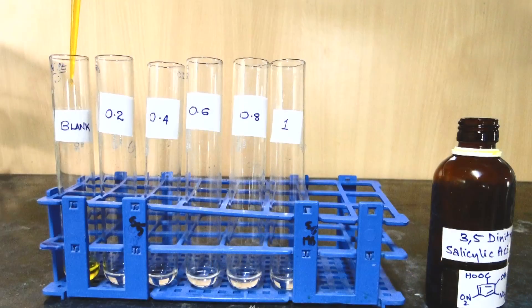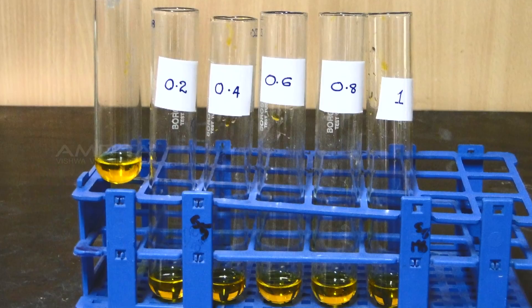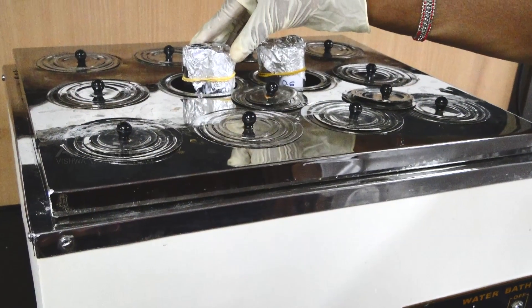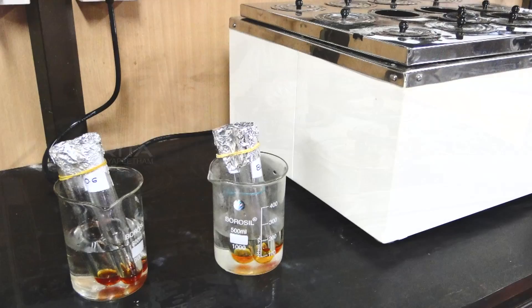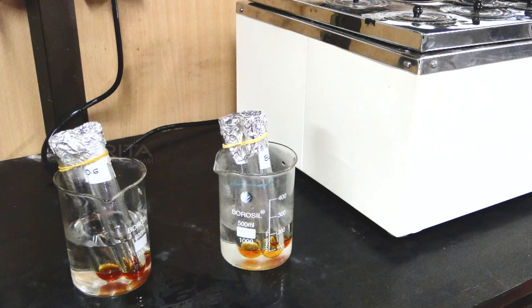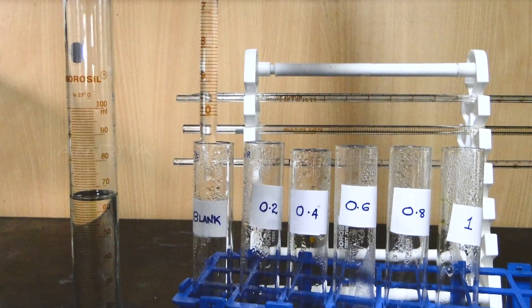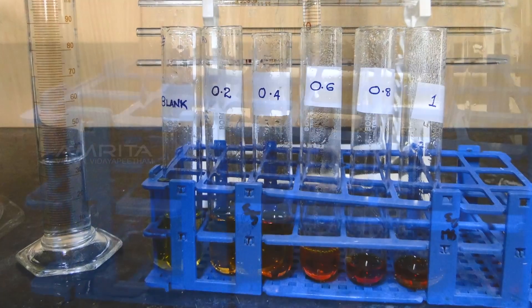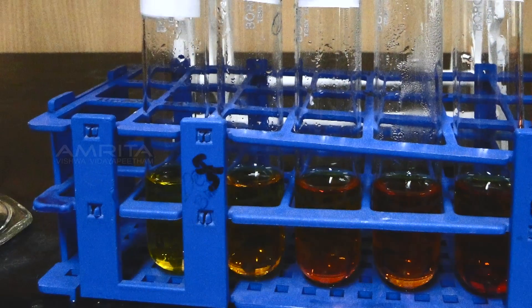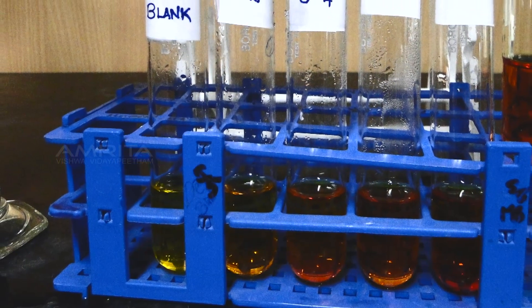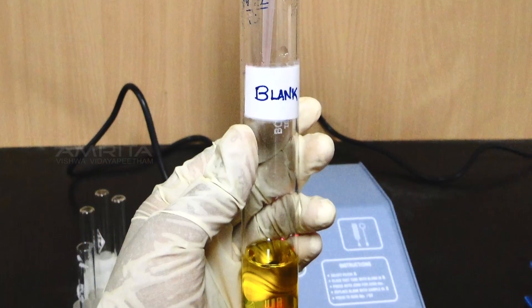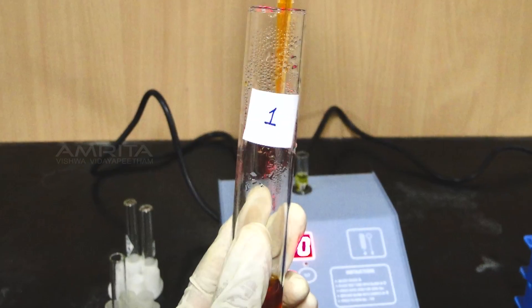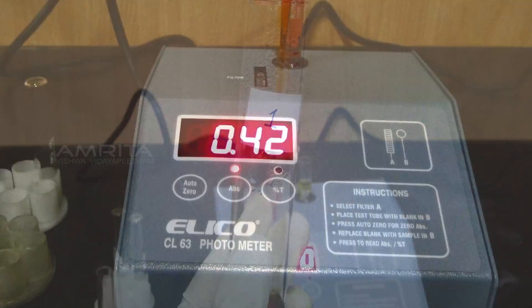Add 1 ml of DNS reagent to each tube. Keep all the tubes in a boiling water bath for exactly 5 minutes and then cool them to room temperature. Add 4 ml of distilled water to each tube and mix well. The intensity of the color depends upon the concentration of maltose, and this change in color is measured using a colorimeter as absorbance at 540 nm wavelength.